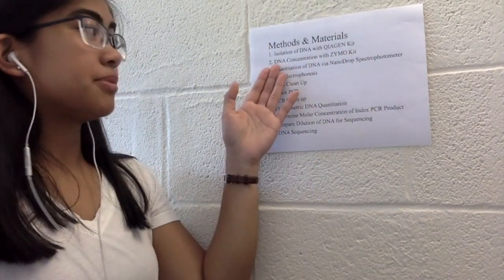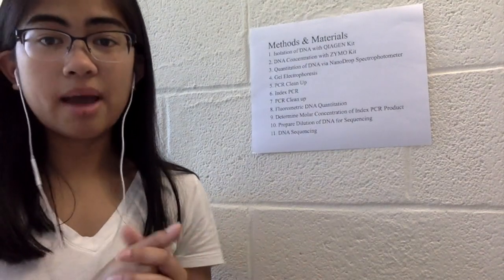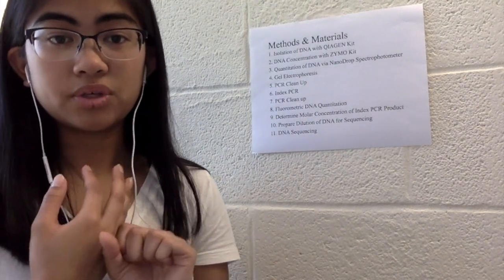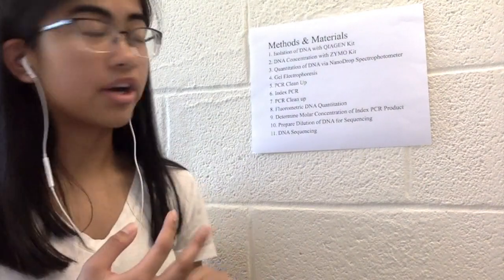Right now for our materials and methods, step 1 was the isolation of DNA with the QIAGEN kit. Step 2 was the DNA concentration with the Zymo kit. The DNA will then be 10 times more concentrated. The amplicon PCR gene that was amplified was the 16S rRNA gene. For our positive control, we used a known concentration of E. coli, and for our negative control, we used water.